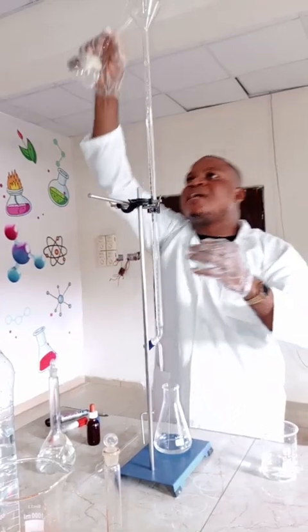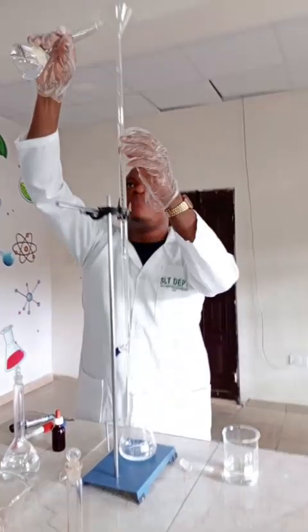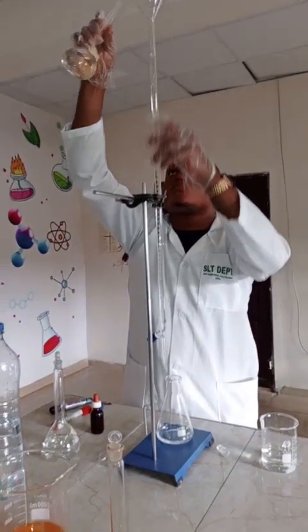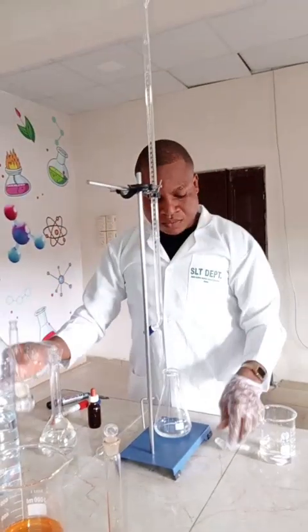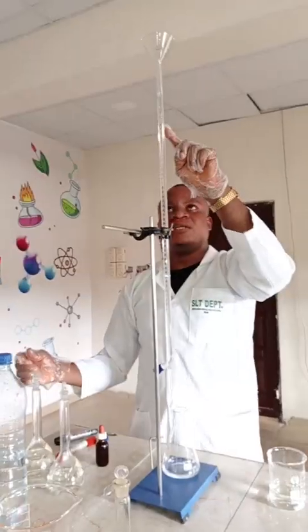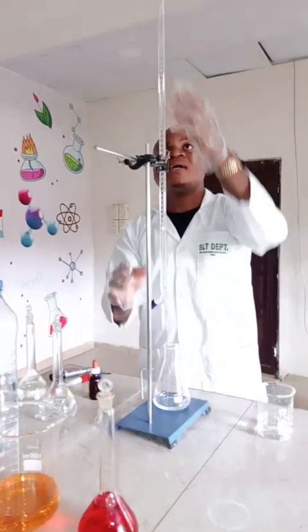I want to make sure this is at the 0 mark on the burette. That's the calibration I'm using. Now this is at the 0 mark. You can see it here. That is at the 0 mark.